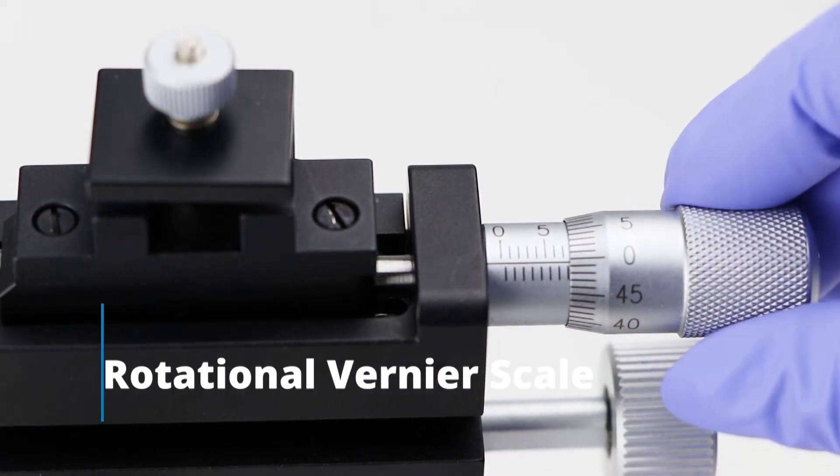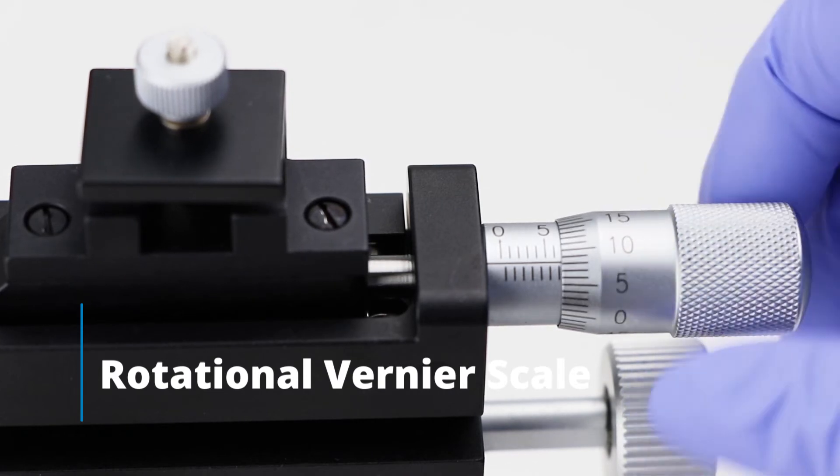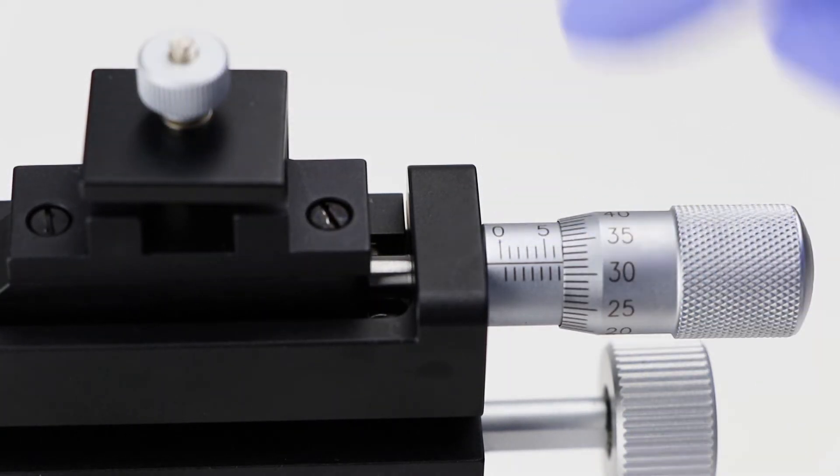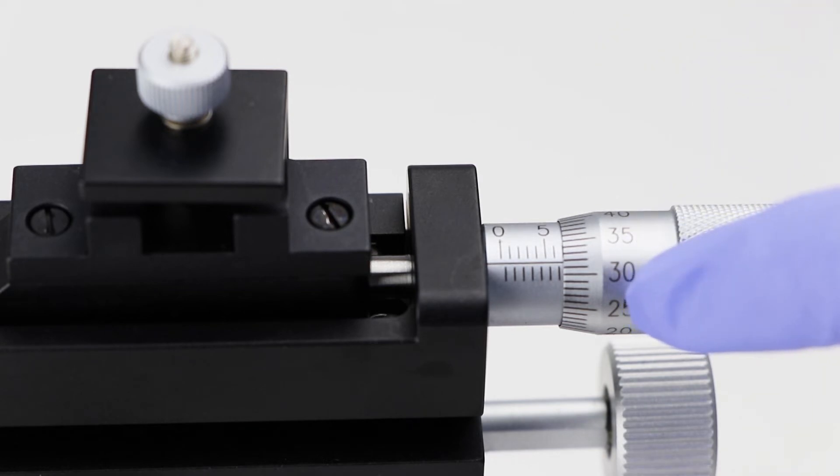On some instruments, the Vernier scale looks like the circular one on my M3301 micromanipulator here. This is the linear scale, and this is the rotational scale.